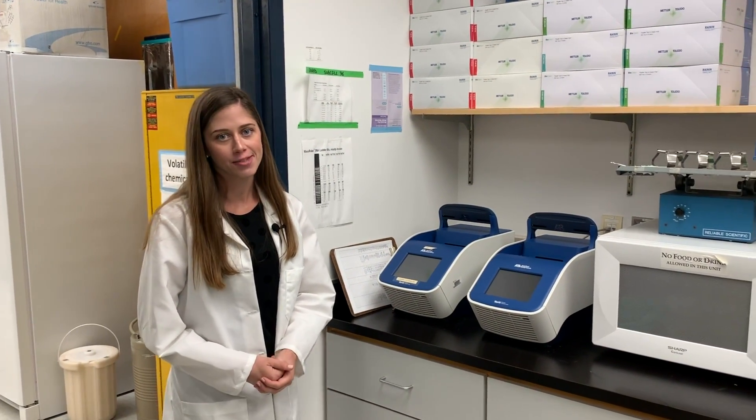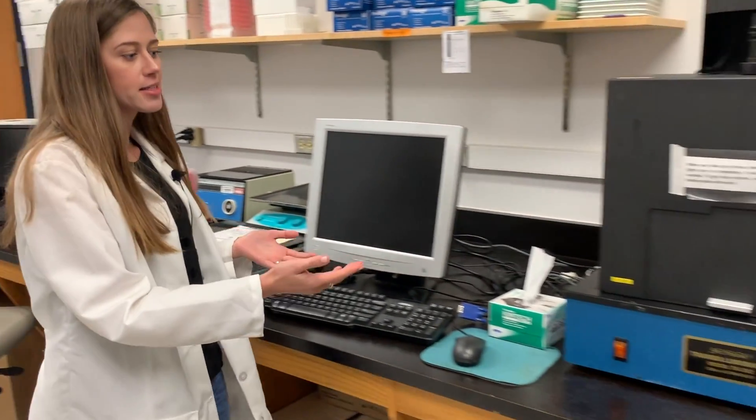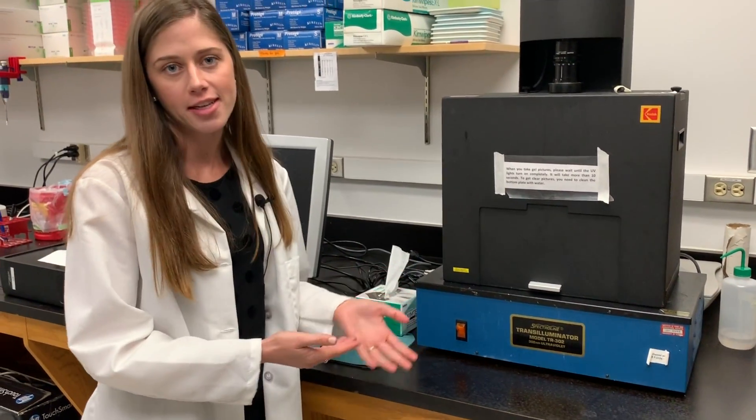Some other machines that we have in this room include our PCR machines, which are basically like Xerox copy fax machines for DNA. Our nanodrop, which we use to measure the concentration of our DNA samples. And this apparatus, which we use for photography of all of our gels.